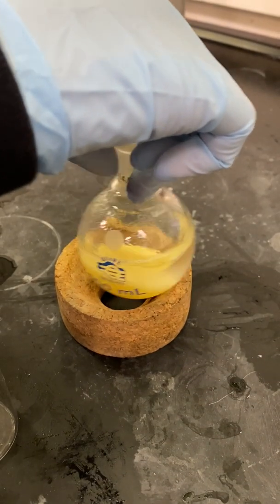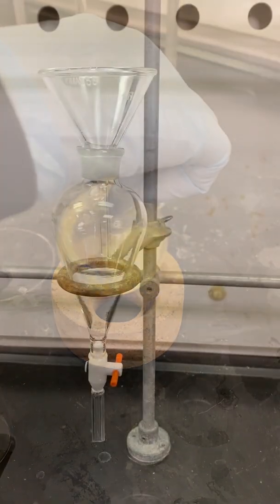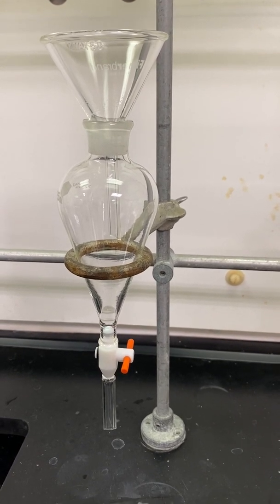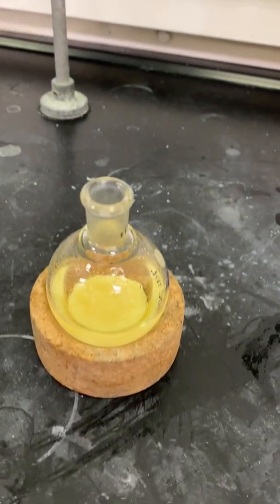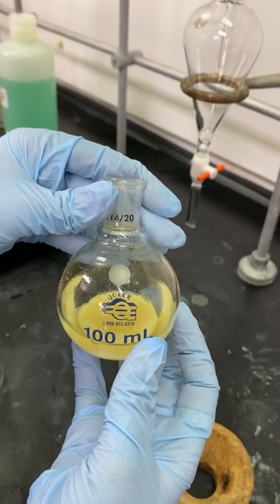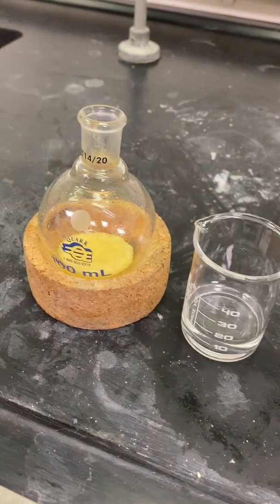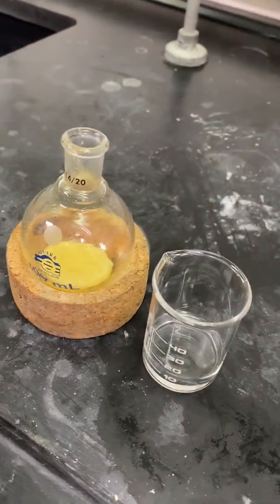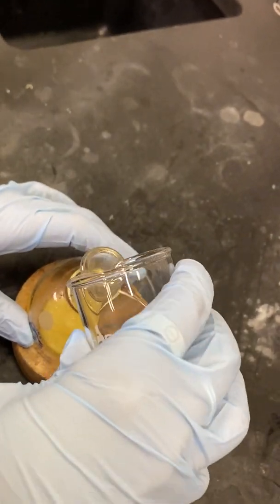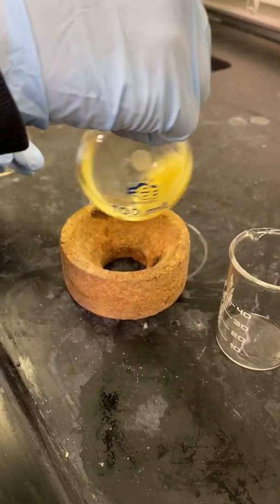I am beginning to gently shake the contents of the flask to make sure my product is dissolving in the ethyl acetate. I will now begin my workup. I have set up my separatory funnel on a ring stand in my fume hood with a glass funnel as well. I will now begin to pour the contents of my round bottom flask into my separatory funnel. I have now measured out about 10 more ml of ethyl acetate and will pour this into my round bottom flask to try and dissolve more of my product before transferring it to the separatory funnel.